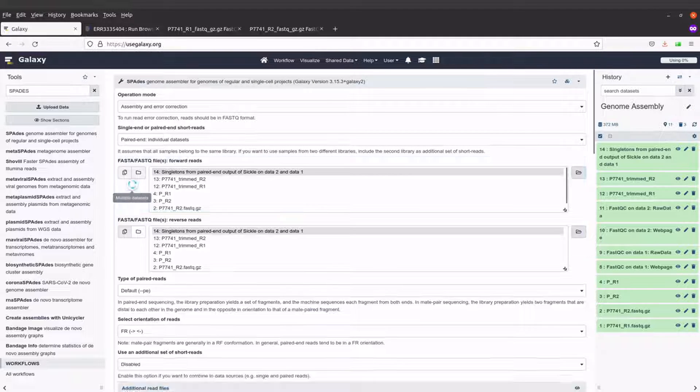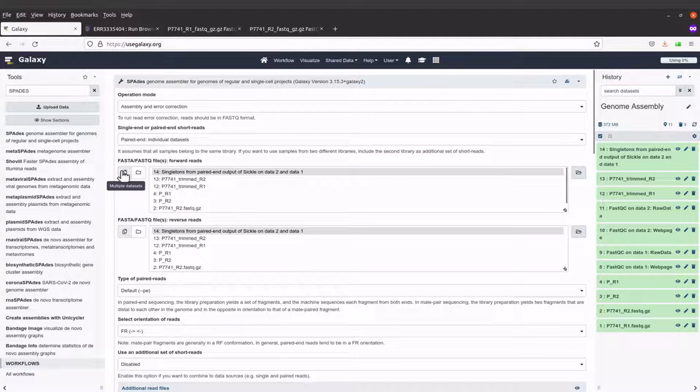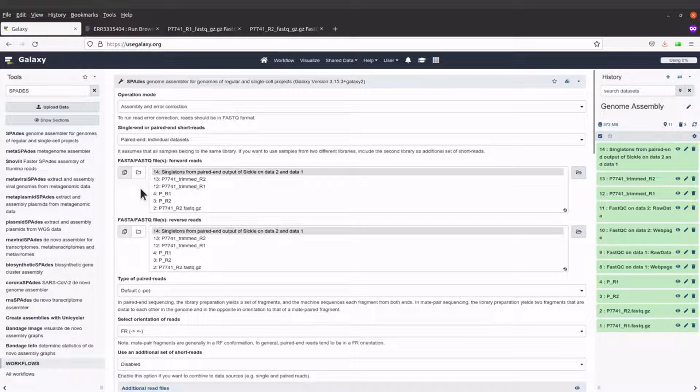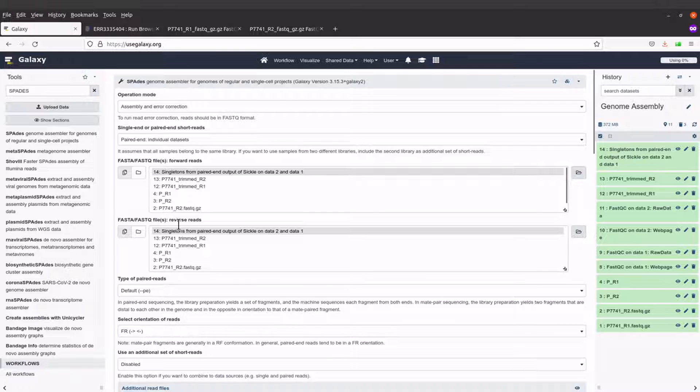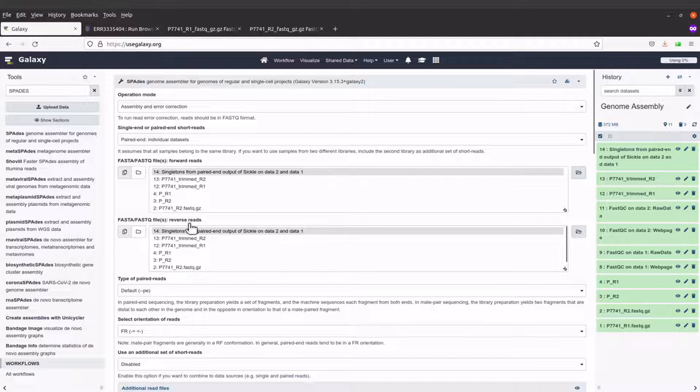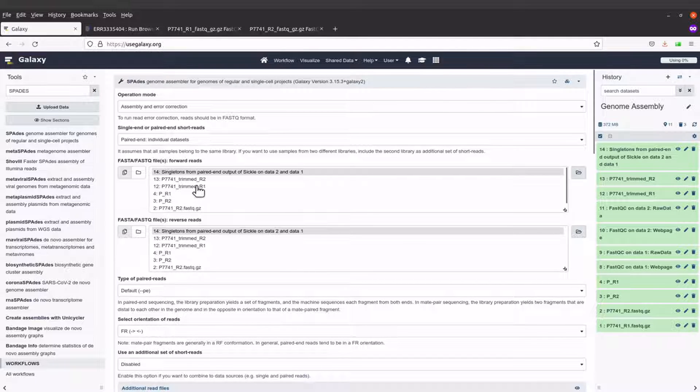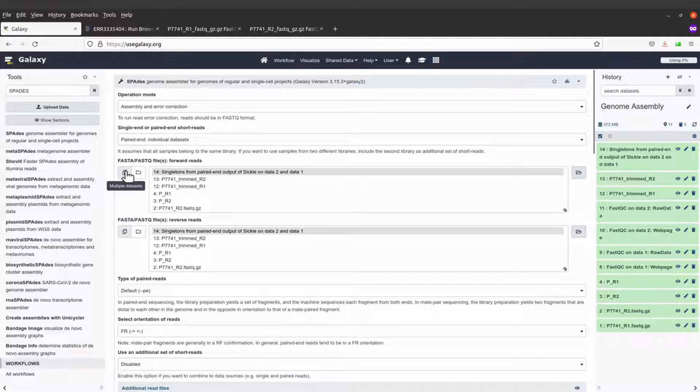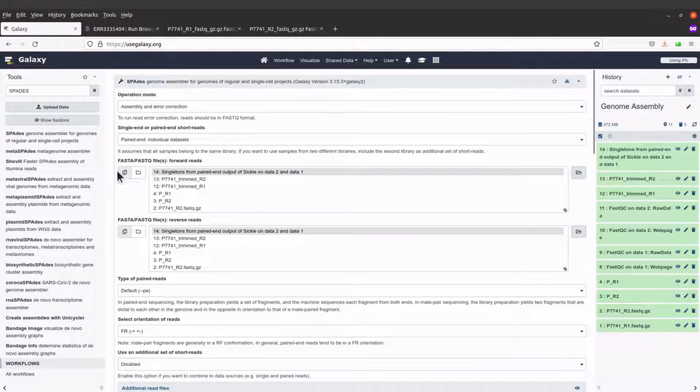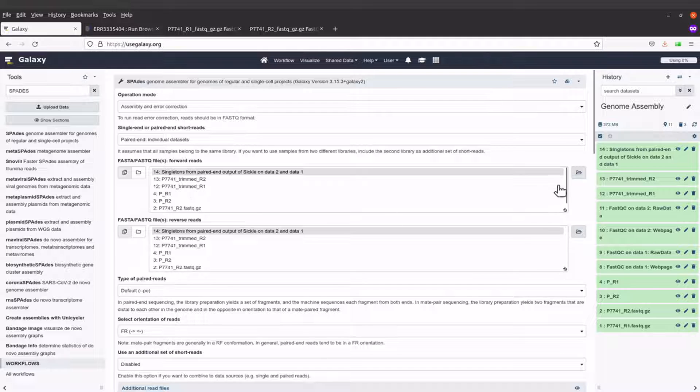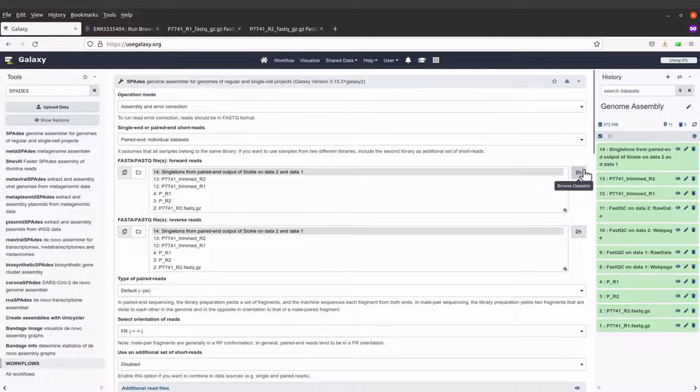I'll just come to this side and select the ones that are of interest to me. Here it says multiple datasets and here it says dataset collection. I'll also use the browse feature here.